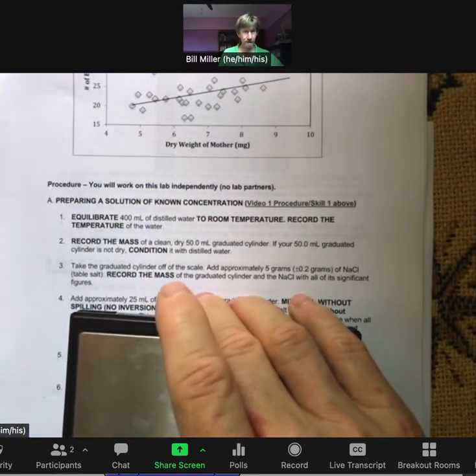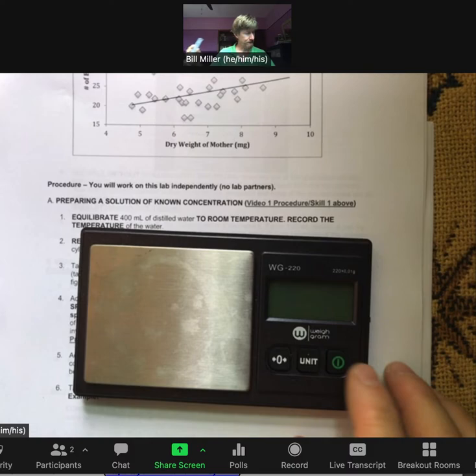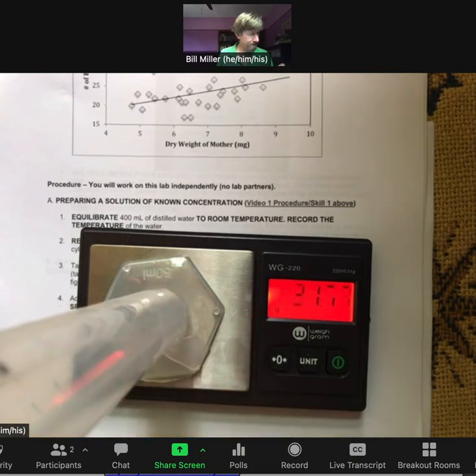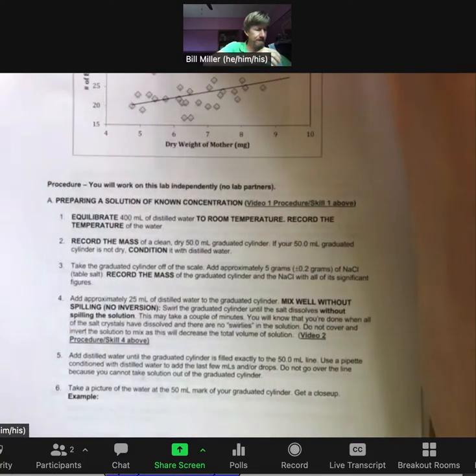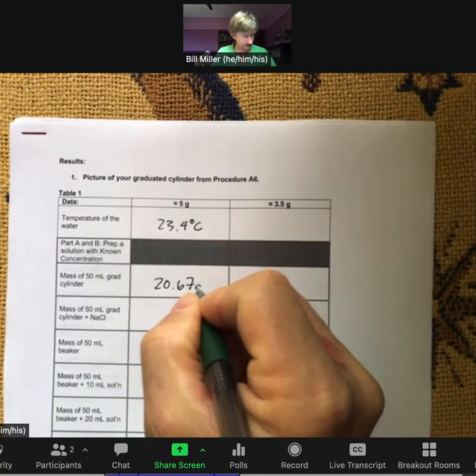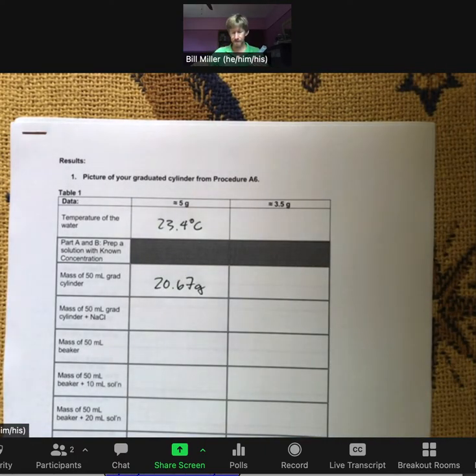The procedure says to record the mass of a clean dry 50 milliliter graduated cylinder. I'll turn on the scale, wait for the zero to appear, and place the graduated cylinder on it. The mass is 20.67 grams. Now it says to take the graduated cylinder off the scale and add approximately 5 grams of sodium chloride.